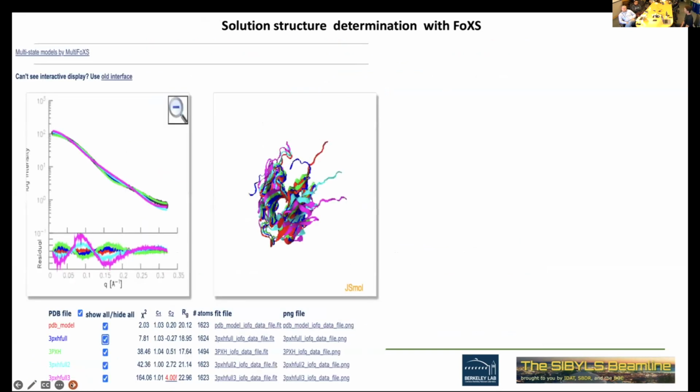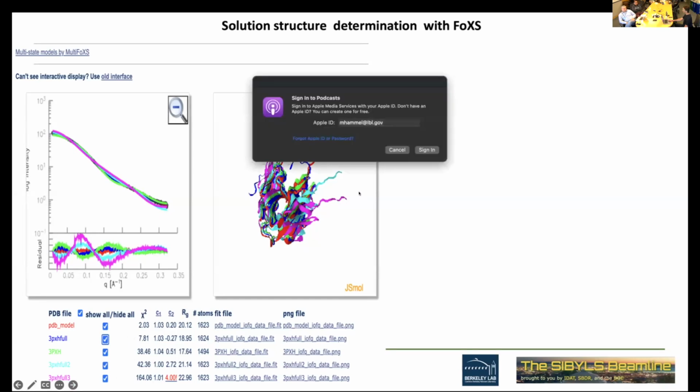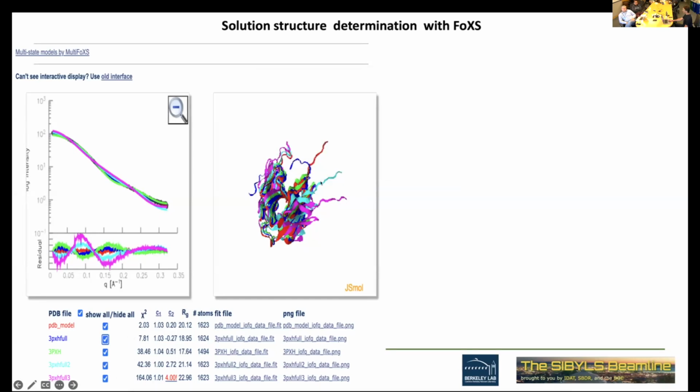Output, in this case, is for a small molecule, and you see there are different models that we have in mind, and all of them fit pretty poorly, except the first one, which is kind of close. The goodness of fit is written here. Here are some adjustable parameters; they adjust automatically, and there is the radius of gyration of the model.